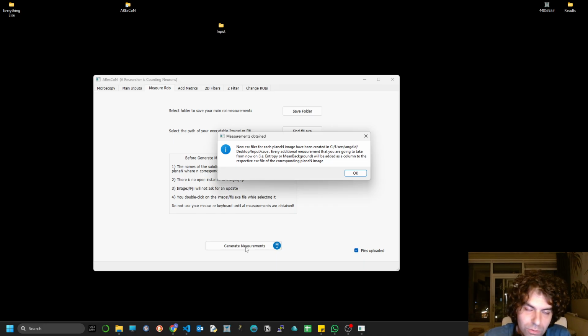So in case your Fiji takes more time, it's possible that the macro will never be typed on the search command because your Fiji takes more time to open, and for that we need to change a particular line in the code. We can have a look after that. I will shortly search for that, but before we get there, let's continue with the pipeline right now.